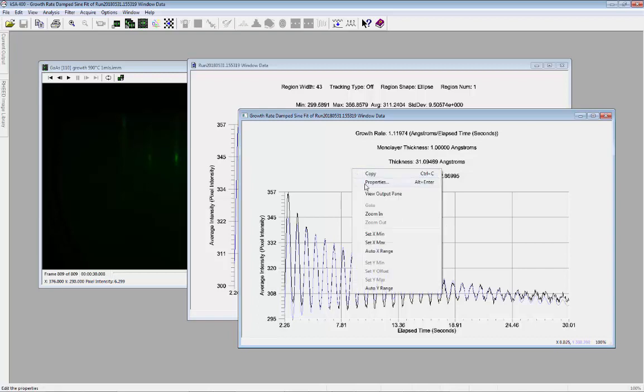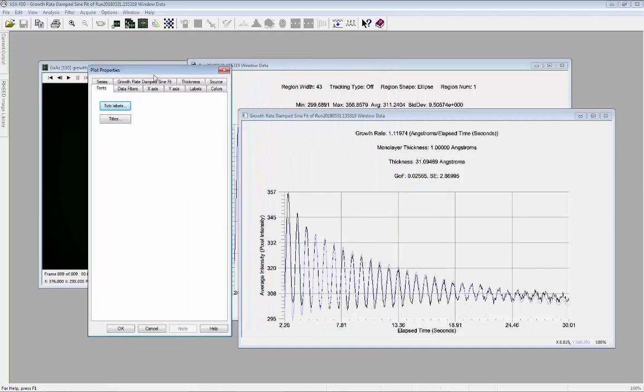Right-click and select Properties, then select the Thickness tab to specify the monolayer thickness in either angstroms or nanometers. This is required to compute the growth rate and thickness. In this case, I will enter a value of 2.86 angstroms corresponding to gallium arsenide. Note that if the monolayer thickness is set to 1, the growth rate and thickness will be expressed in monolayers, which some users may find more useful.